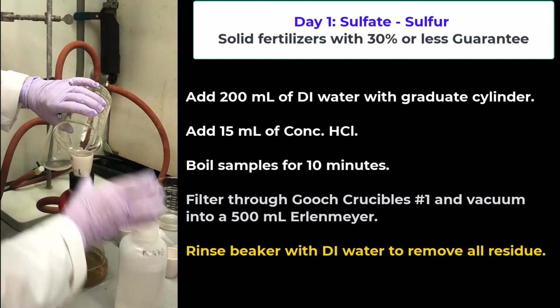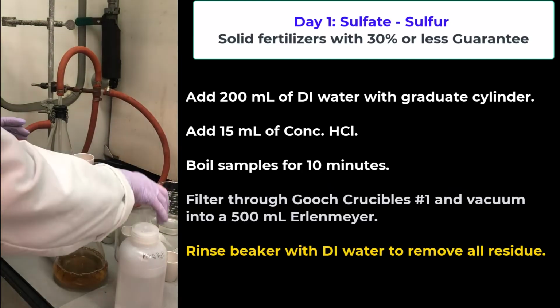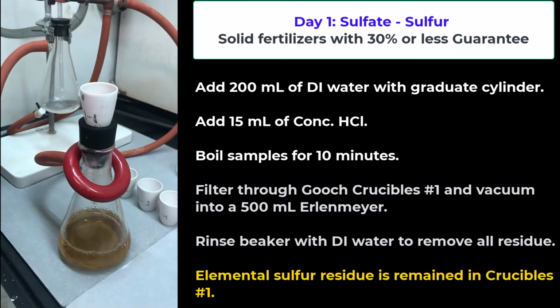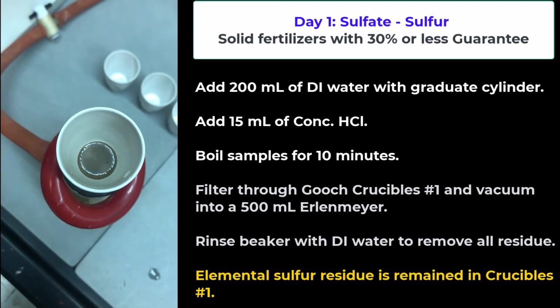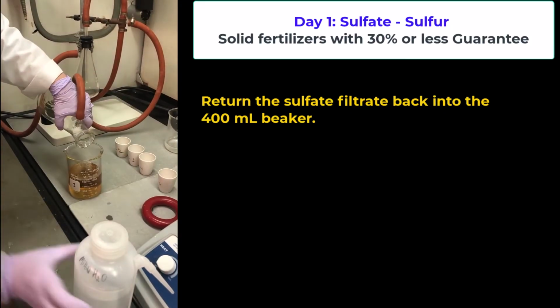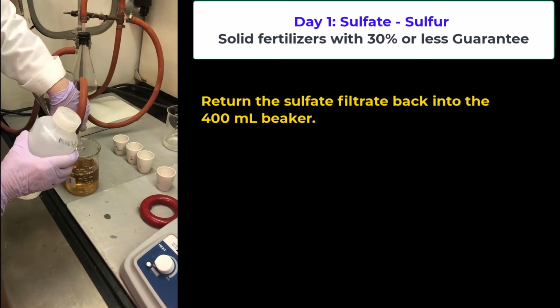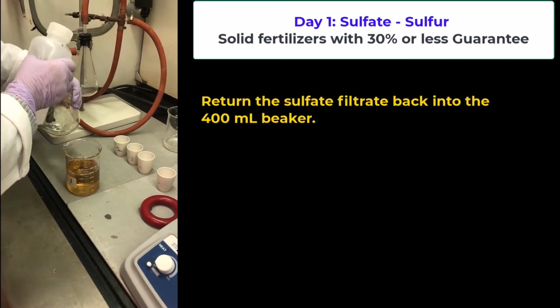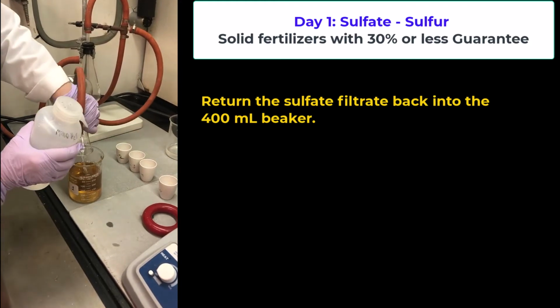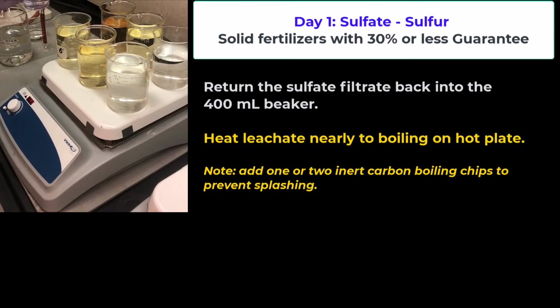Rinse beakers with DI water to remove all residue. Elemental sulfur residue remains in crucible number 1. Return the sulfate filtrate from the vacuum flask back into a 400 ml beaker. Heat nearly to boiling on hot plate.